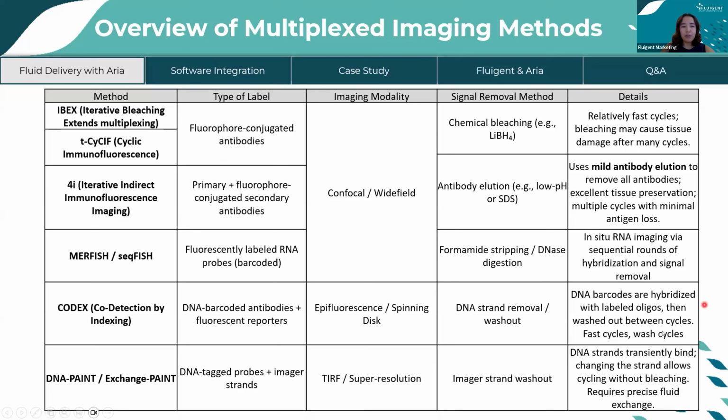But overall, the important part is that no matter which technique you use, whether it is SeqFISH or Codex, or what imaging modality you would choose, perfusion is an essential step to control and automate the delivery of the reagent and the removal of the reagents, so you can trust the results, preserve the probes that you're using, and have a high precision in your reagent delivery.